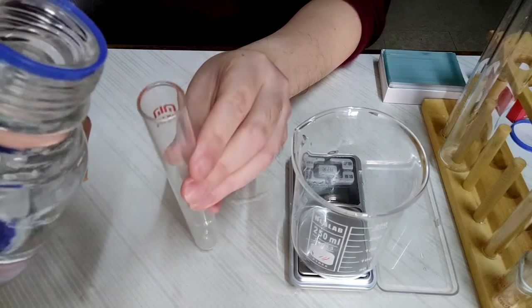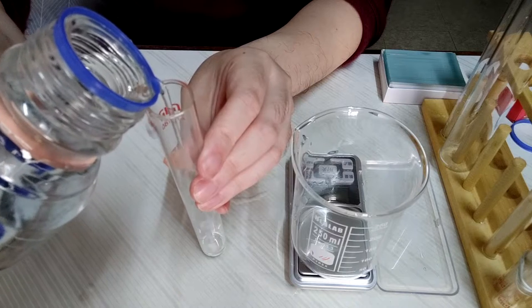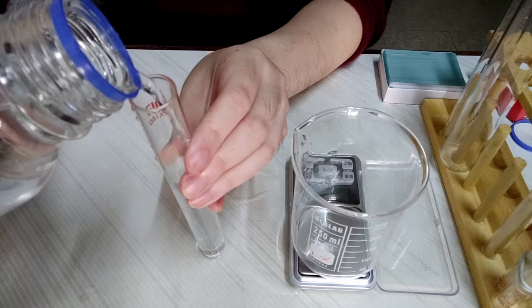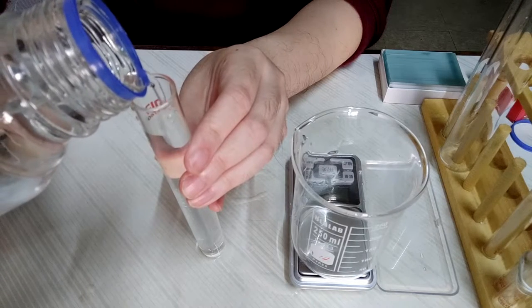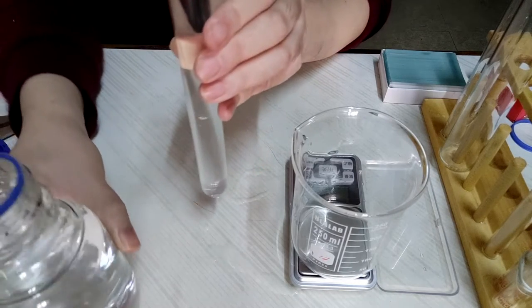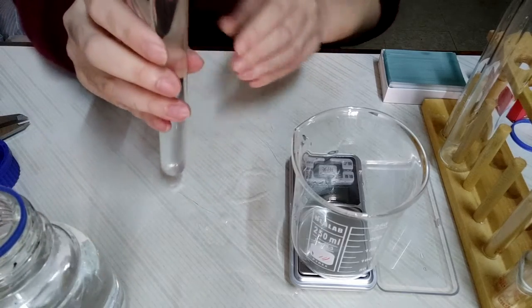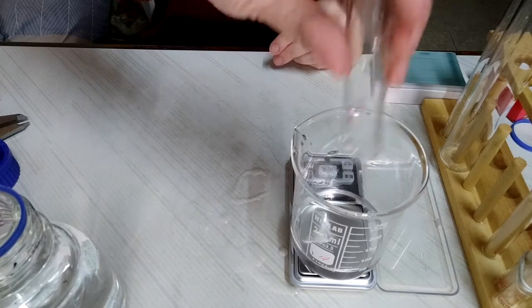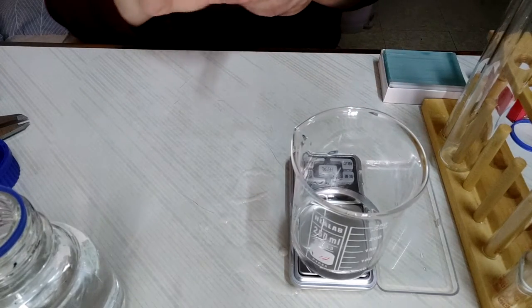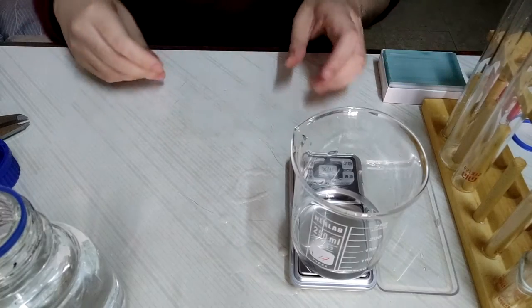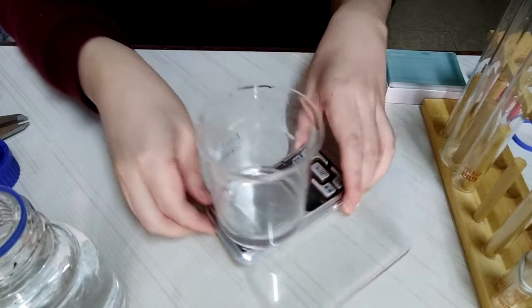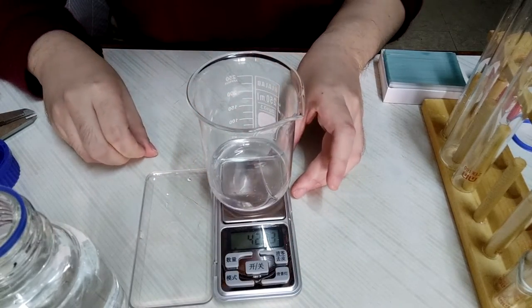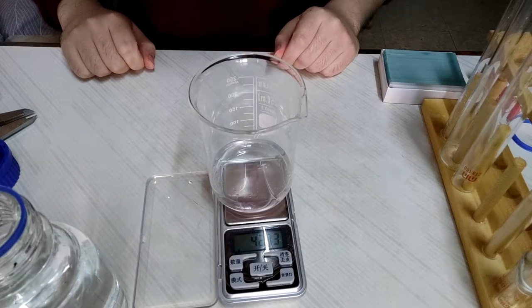Now for the volume, the volume is around 40 milliliters.